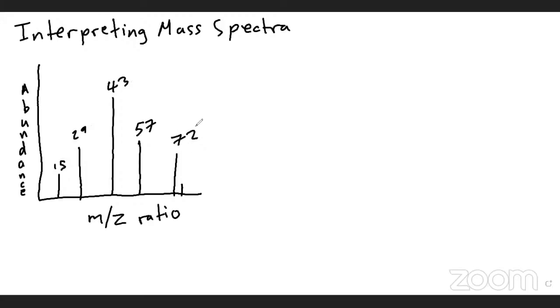The heaviest one is always at the end. And that one is your molecular ion peak.